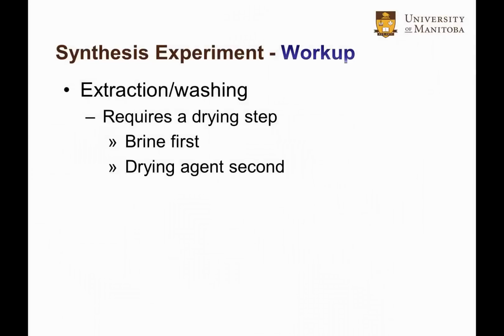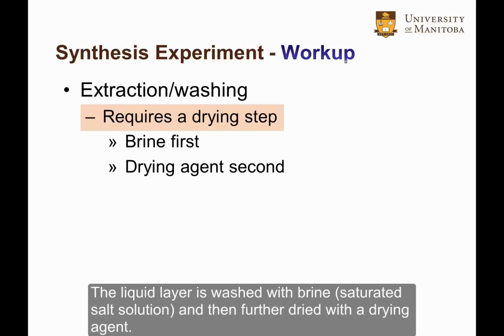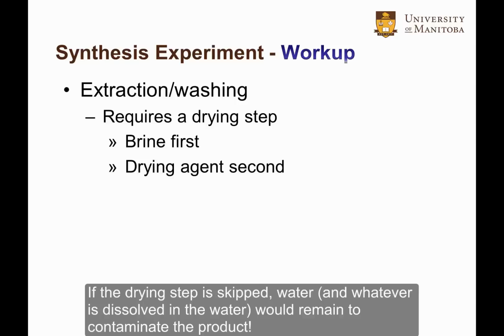After an extraction or washing, the organic layer will typically require a drying step to remove any residual water. The liquid layer is washed with brine, saturated salt solution, and then further dried with a drying agent. If the drying step is skipped, water, and whatever is dissolved in the water, would remain to contaminate the product.